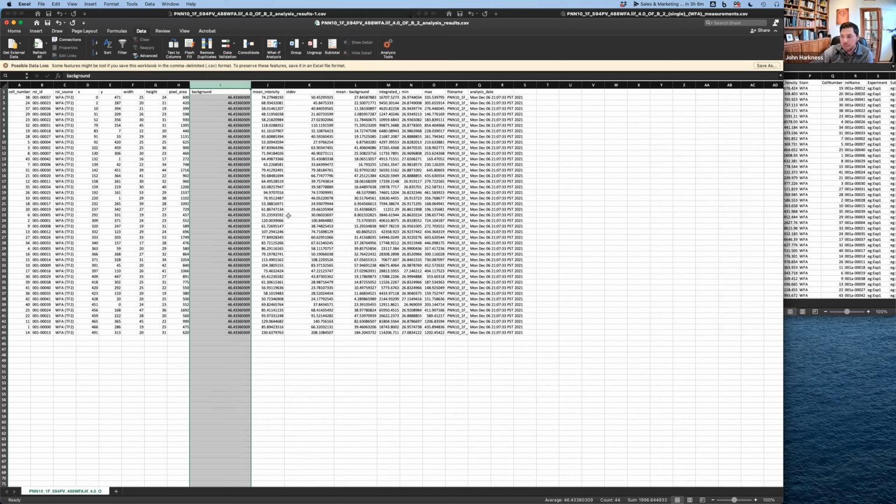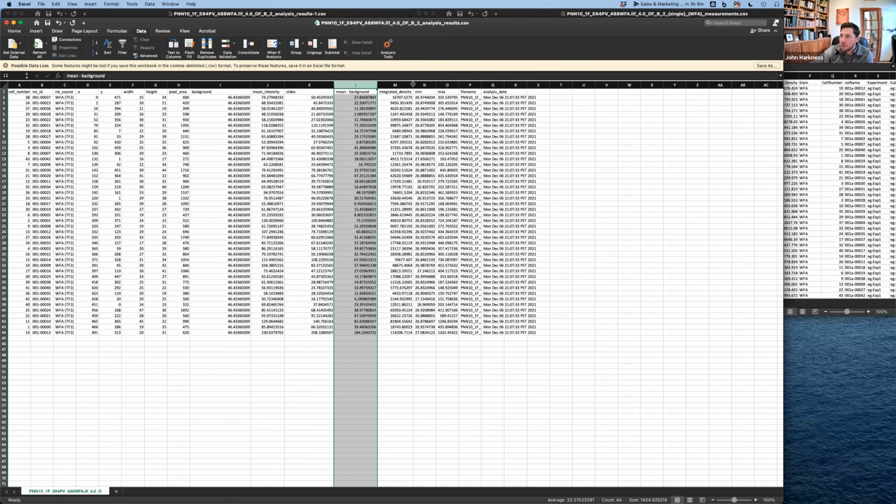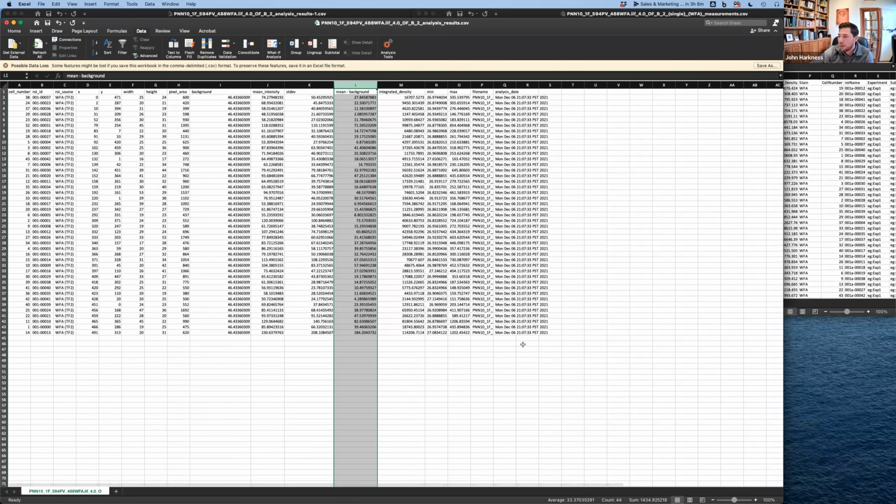And then for our methodology that I've published with Dr. Sorg, we are now reporting the mean minus background value of intensity. So that's a good way for us to show actual signal within that ROI. There are a couple other metrics in here that we've gone into in other webinars, and I'd be happy to talk to you about them more specifically outside of this.